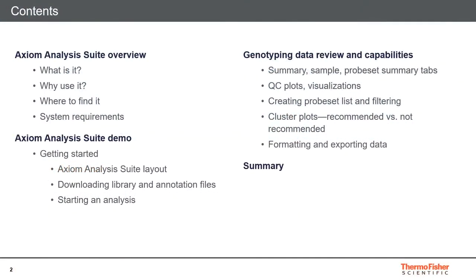We're going to cover an overview of the Axiom Analysis Suite software, what it is, why you want it, and where to find it. Then we're going to jump into a demo where we're going to cover the basics of getting started and running an analysis, along with the features and capabilities.